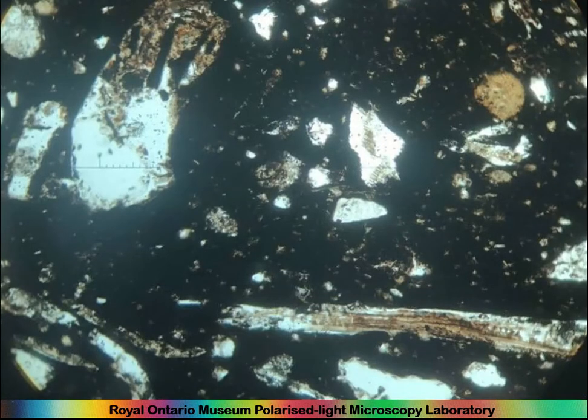So here's a thin section with some plant fibers. Here you can see this still has relics. If this is a completely reducing conditions firing, the fiber is entirely black, as you can see. And so when that happens, sometimes the carbon isn't driven away. Typically for an oxidized firing, the carbon and the oxygen will go together and come out and create global warming. But in this case, it's still in the pottery. And so you can clearly see that this is a plant fiber.